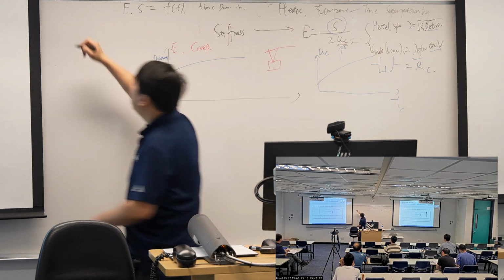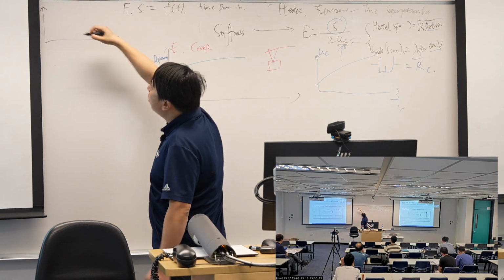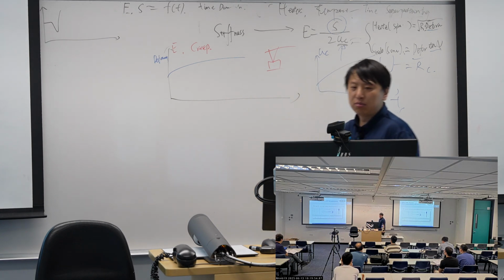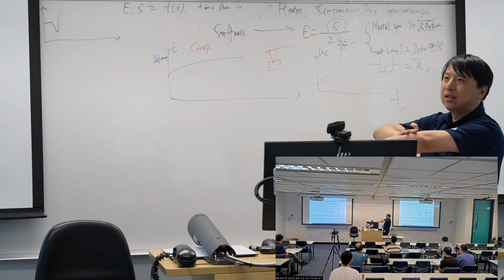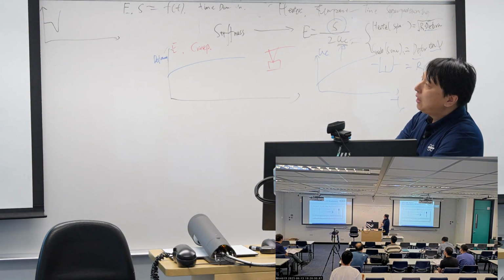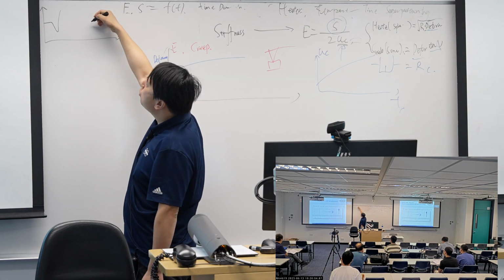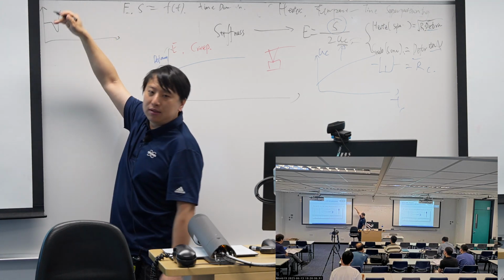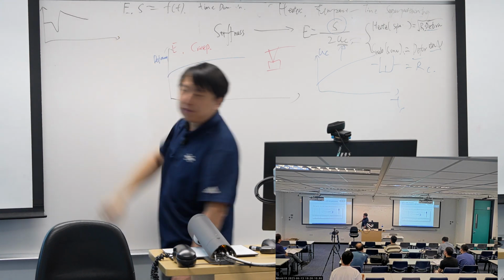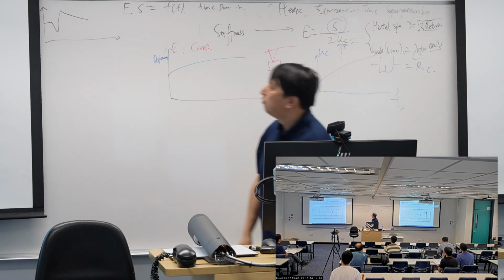So Bruker made the recommendations in this way. When we do a force curve, we let the probe hold on the surface and then hold for a while. At the beginning of this hold segment, we would usually let the probe hold for a while, so let it creep for several seconds.